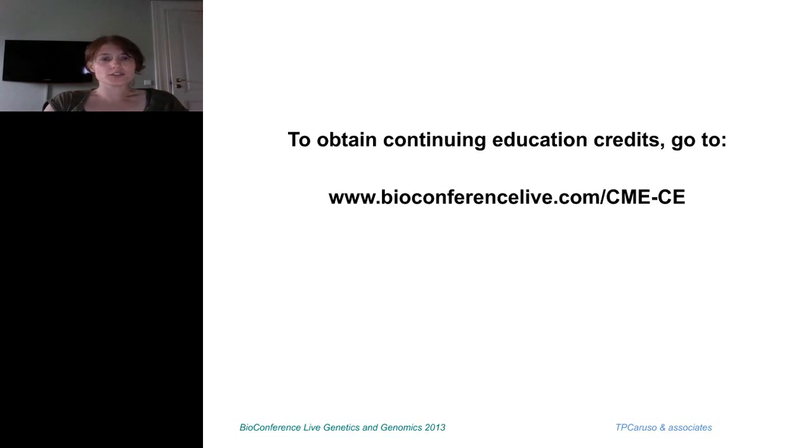Now, the next question: do we need to confirm again by Sanger sequencing after finding a variant by microarray? I had this question coming through a lot, and really the good practice is that yes, you do.